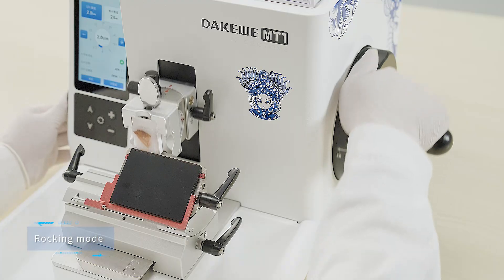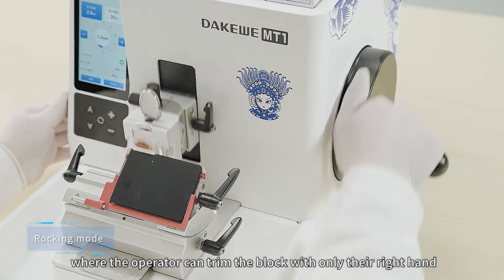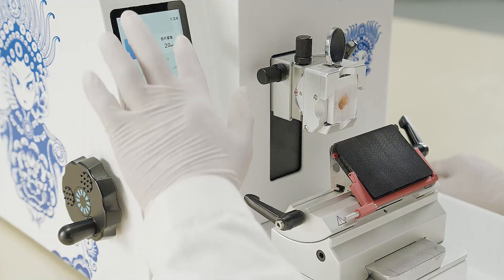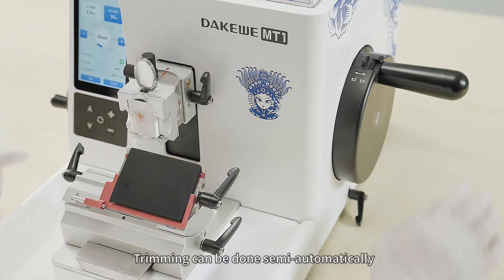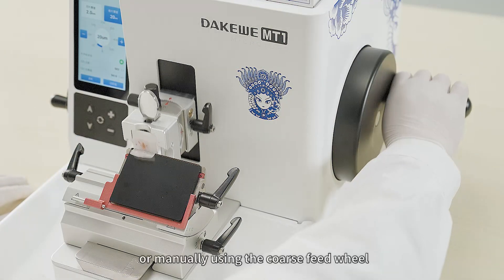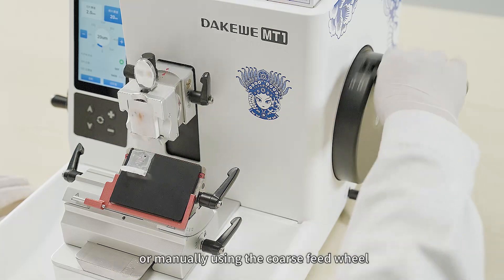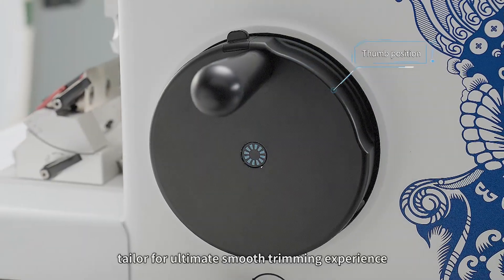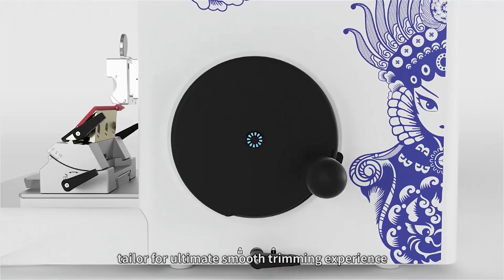The MT1 features a rocking mode where the operator can trim the block with only their right hand. Trimming can be done semi-automatically or manually using the coarse feed wheel, with a user-friendly thumb position tailored for an ultimately smooth trimming experience.